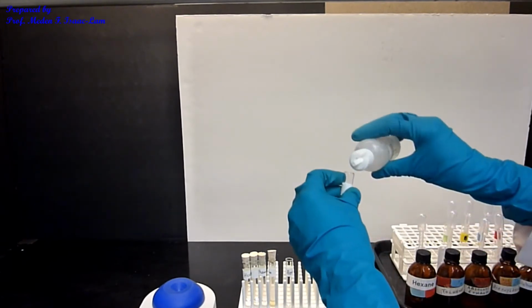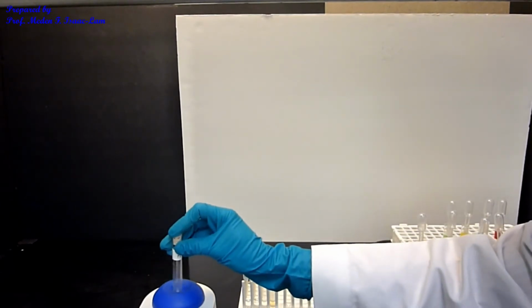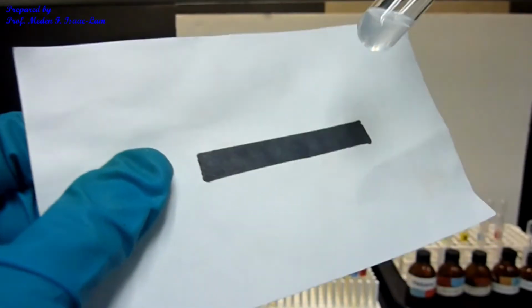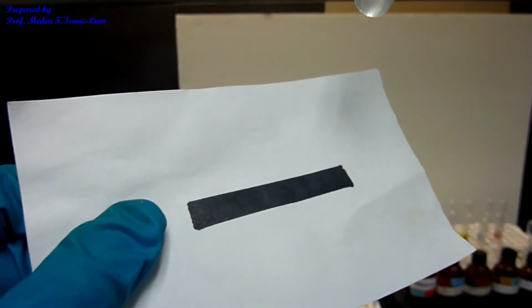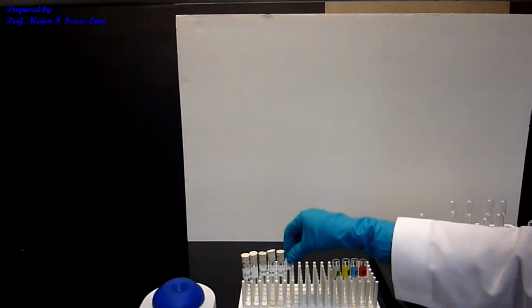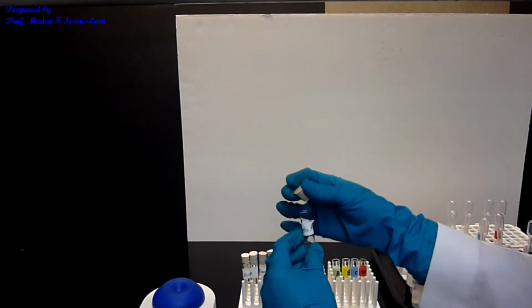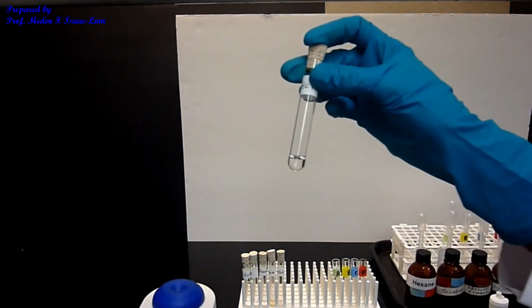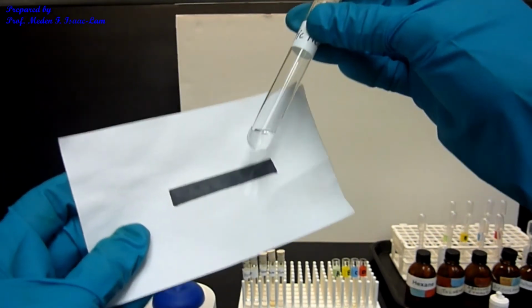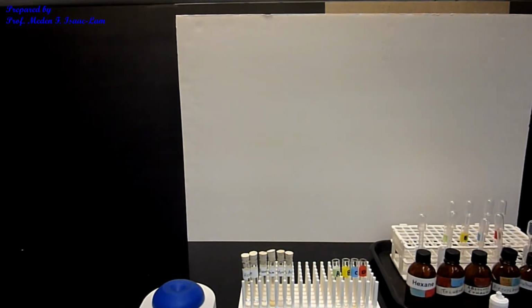So acetone, mix it up. So I don't see, there's a little bit of turbidity. Okay, it's a little bit cloudy. All right. Okay. So now acetic acid. Acetic acid, again 8 drops. Then mix it up. So nothing really happened. Okay. So I don't see any smoke. I don't see any droplets on the side. Nothing. All right. Okay, so now that was the 6 samples.